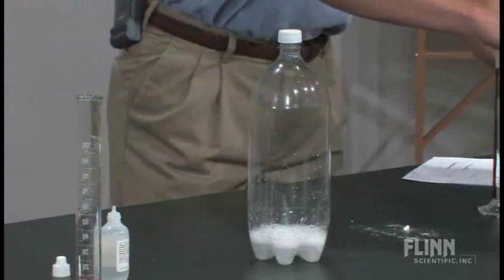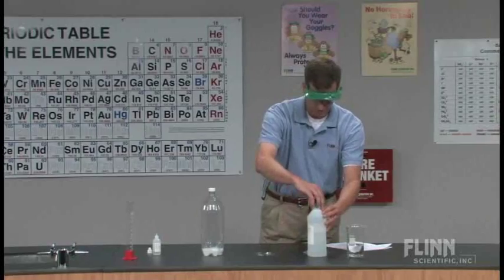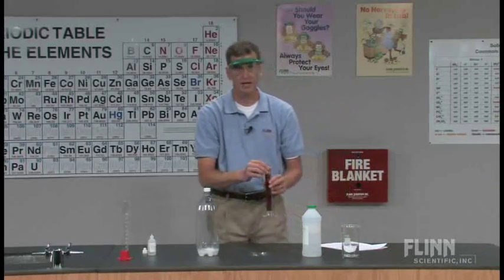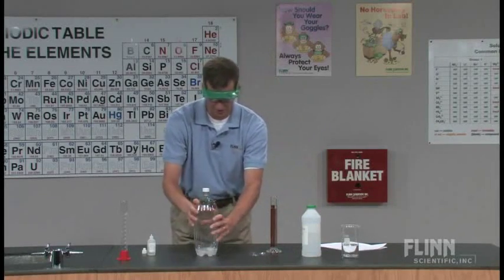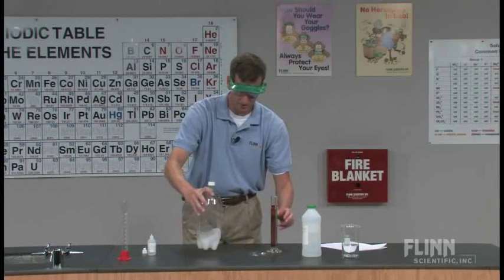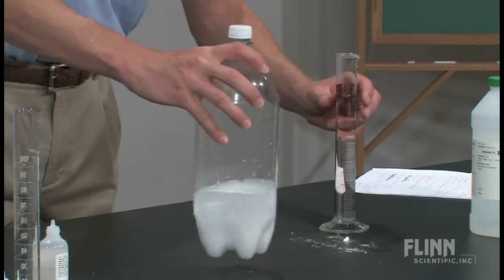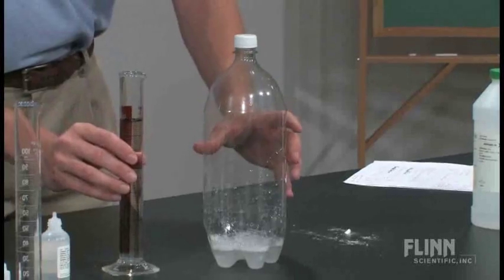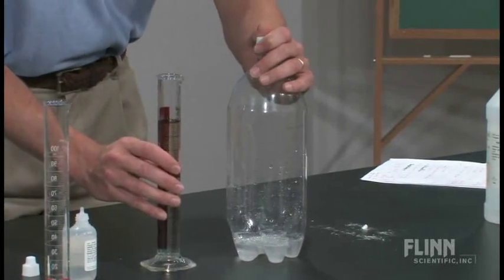That's getting rigid again. I'm going to measure out 100 milliliters of sodium hydroxide, one molar. As I react that, the CO2 in the gas is going to react with the OH negative ions in the sodium hydroxide. You should see a color change, and you should see something rather dramatic happen to the bottle. So I'm going to take that lid off — all of my Alka-Seltzer tablets are now gone.